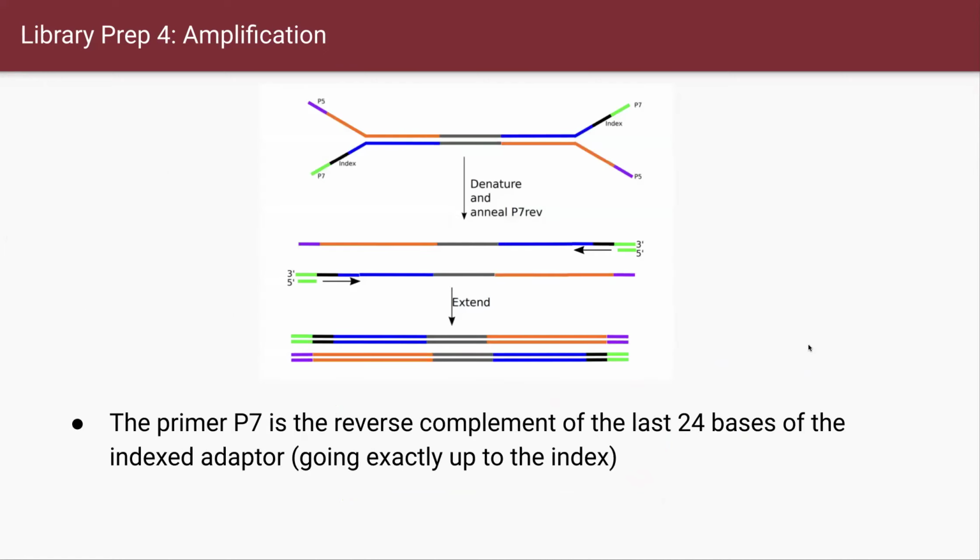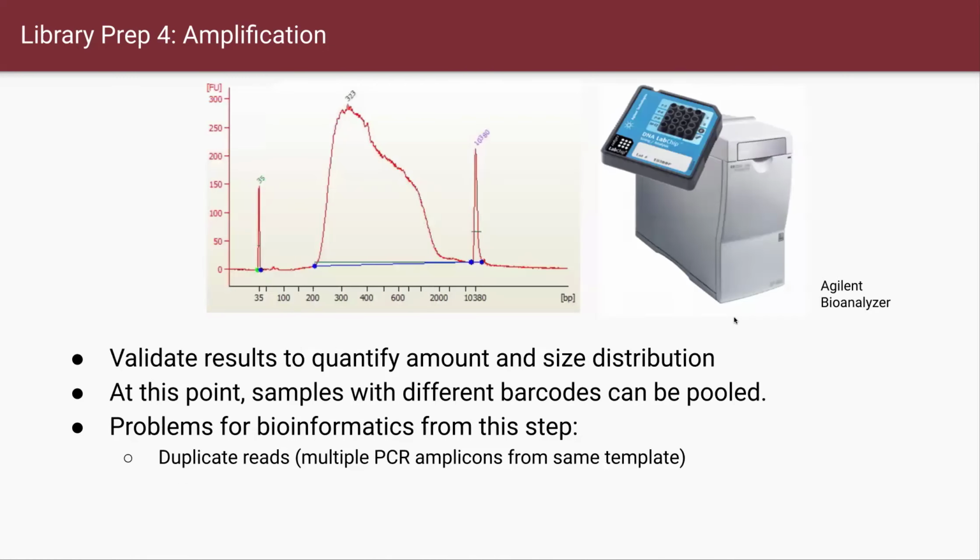Okay, anyway, for amplification, we use this primer information within these adapters. Then we use that information, and we can easily make a PCR amplification. Okay, so that is the amplification process.